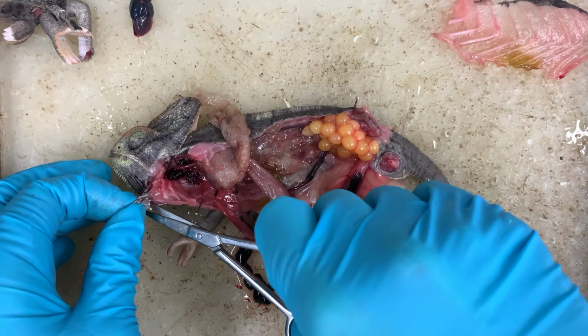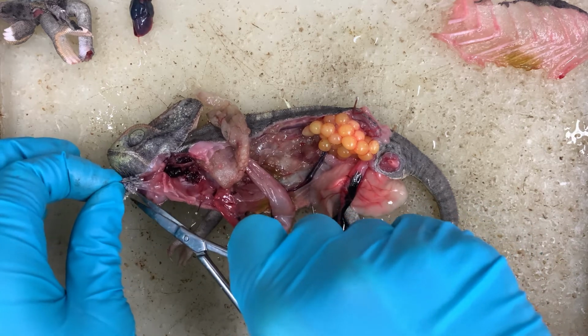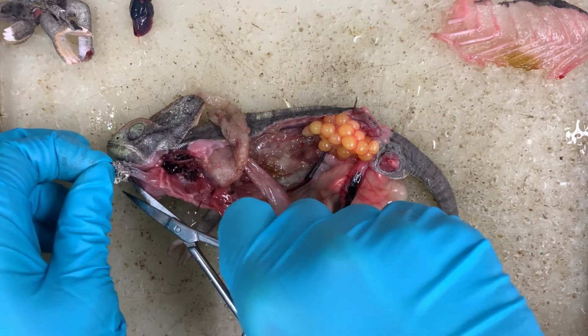We next want to look at the ballistic tongue mechanism of the chameleon. To access it, we remove the skin from the gular region.